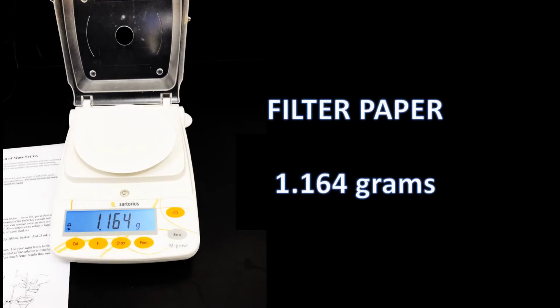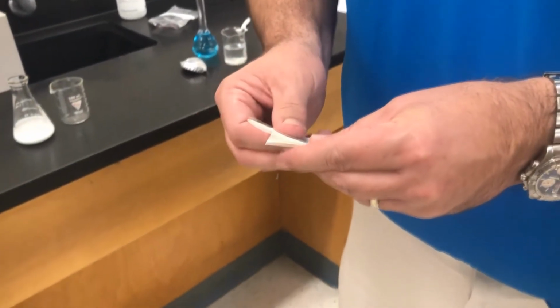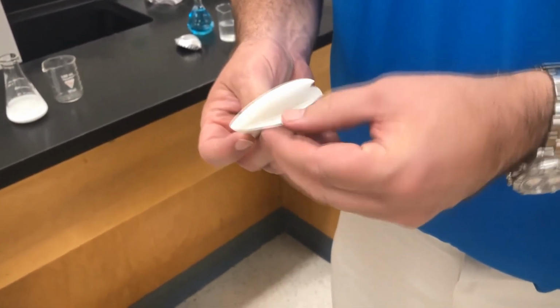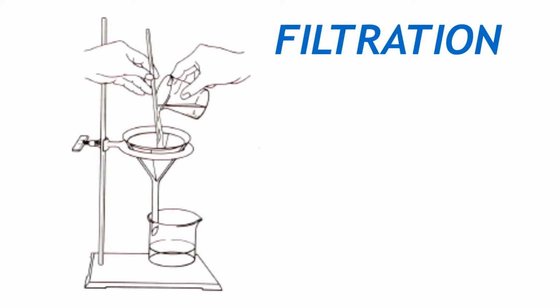The filter paper will be used to isolate the precipitate. It weighs 1.164 grams. It must be folded from a circle into a semicircle, which is then folded inward to make a cone that can be inserted into a funnel. Our setup is that the funnel will be held in an O-ring attached to a ring stand.